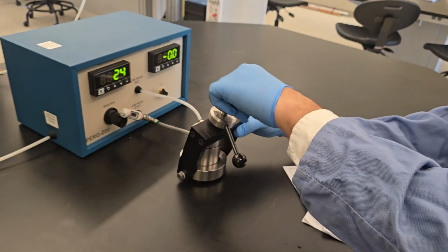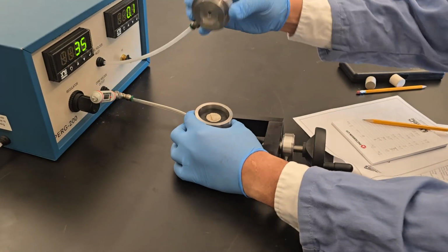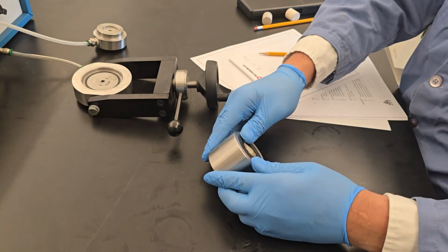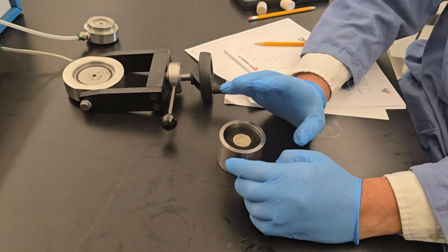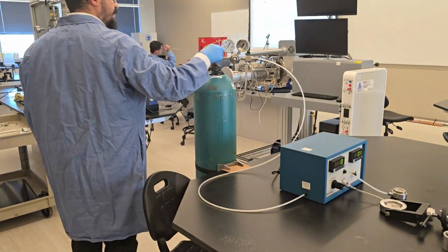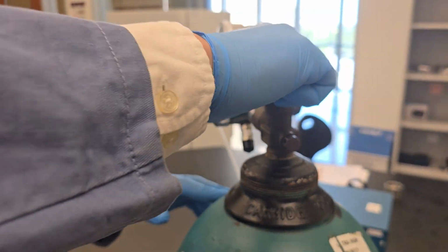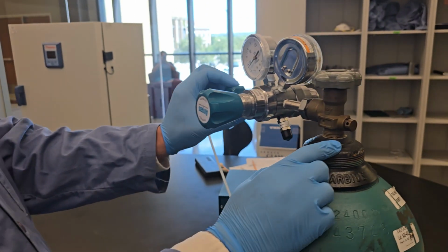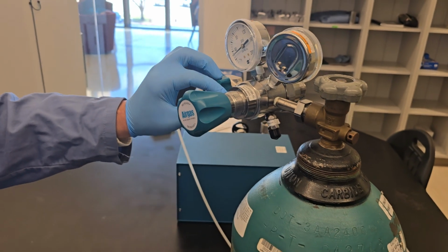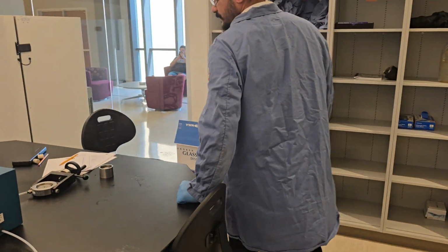Same way, out. Go, disconnect this, and leave the sample ready for the next person. And leave it like this. Then make sure to close all the valves at the end of each experiment. So we close this valve, close the main valve, close the small valve, and open the regulator all the way. Okay? And by then we are done with this experiment.